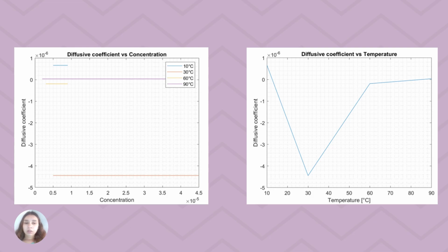However, in practice, we did not obtain results that agreed with the theory, so there may have been errors in the data collection as well as errors induced by the choice of an epsilon that corresponds to a compound other than the one that composed the majority of the repellent. In addition, micelles were observed when the repellent was added to the water, which means that a non-polar phase with hydrophobic compounds was present in the repellent, which explains why the diffusivity values obtained have a very low magnitude. This means that the diffusion of the repellent in the water medium is very difficult and slow.